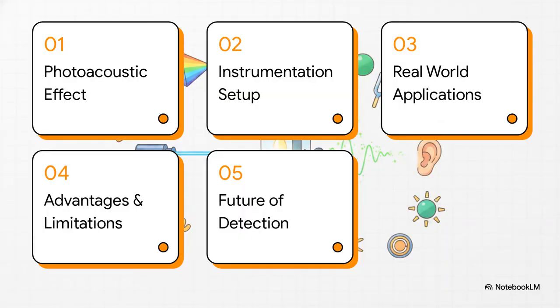So, here's our roadmap for today. We'll start with the photoacoustic effect itself, then look at the instrumentation and setup. After that, we'll dive into applications in the real world, weigh the advantages and limitations, and finally peek into the future of detection. Let's get right to it.